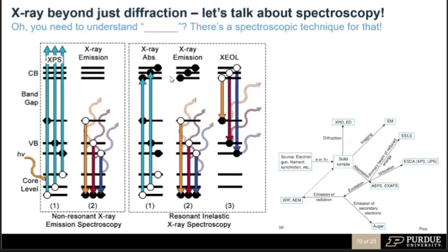And I promise I'll only mention selection rules once. Basically, there's a couple of different measurement techniques. When we take an X-ray, we shoot it at the sample, and any number of processes like this can happen. Oftentimes what's harder about these measurements is that all of these things are happening, and you need optics to sort one out from the other. Each thing comes with something very different.